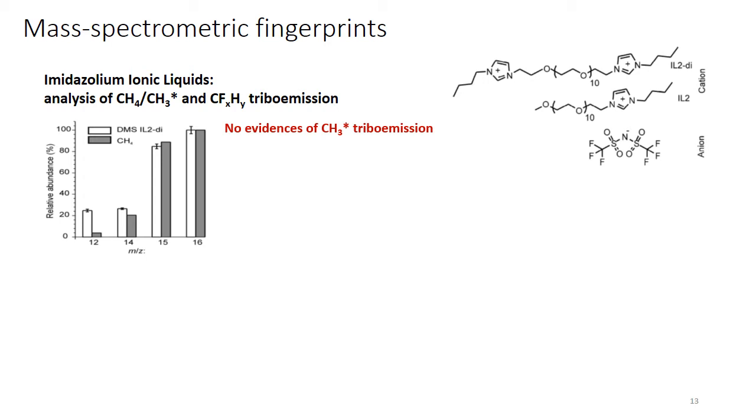And so you can see here that the relationship for mass 15 is very close to the theoretical one. However, in masses 12 and 14, there is a certain excess of ions in comparison with the theoretical mass spectrum. What does it mean?